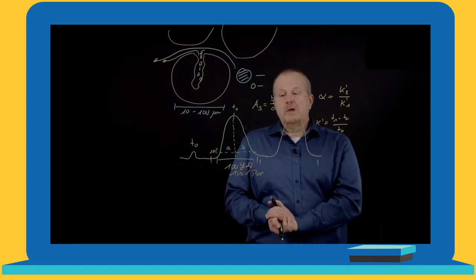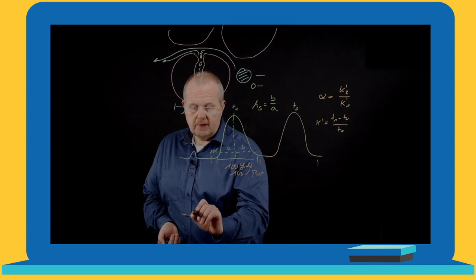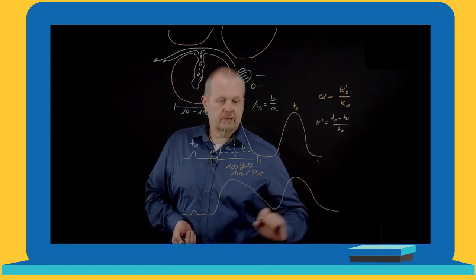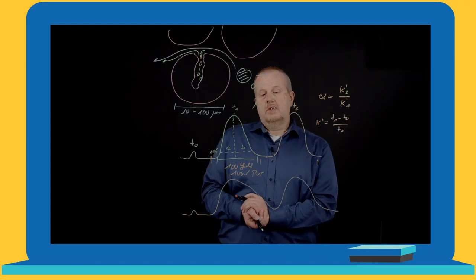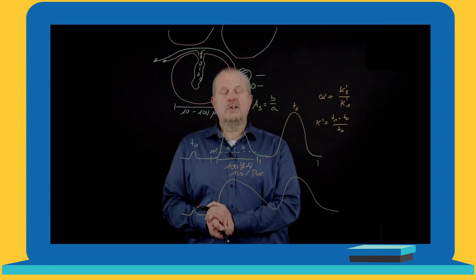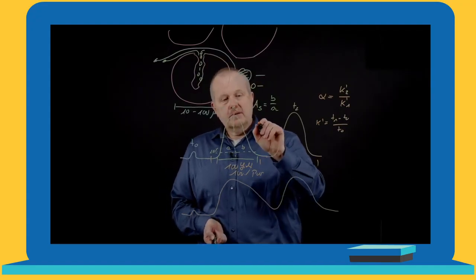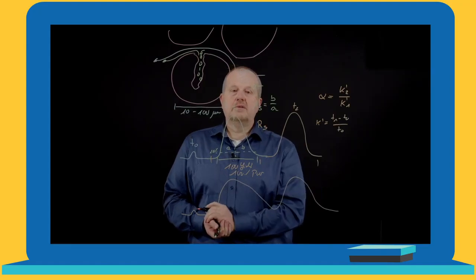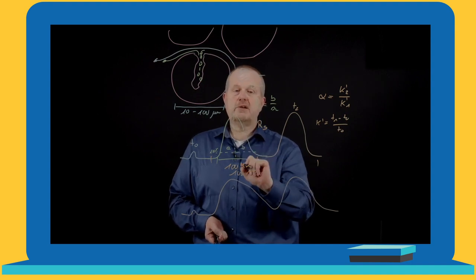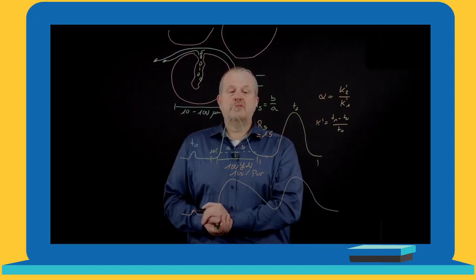But this ideal chromatogram is not what you see often in reality. Often in reality, you have a separation which looks more like this. First compound, second compound. Very poor separation, so no complete resolution. And resolution is what is counting in preparative chromatography. Resolution is defined as the distance between the two peaks. So if we have a separation where our UV signal goes back to baseline and then the second peak appears, then resolution equals 1.5.